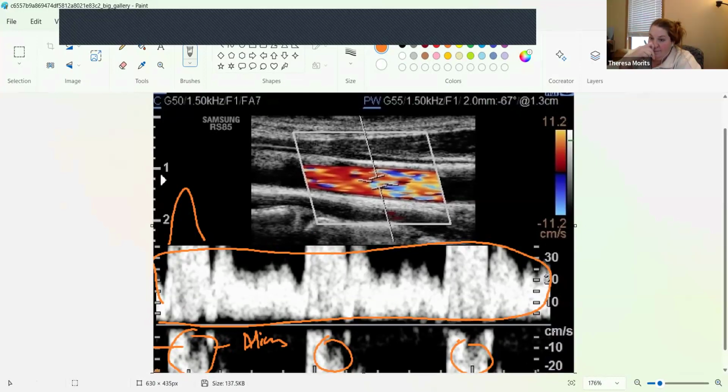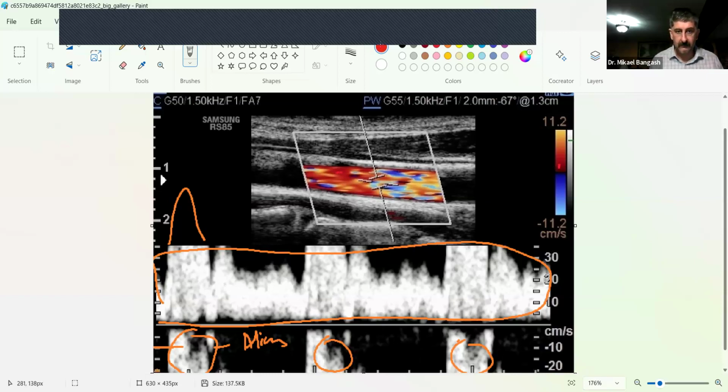Yeah. Good. Now just look at this colored blood vessel here. If you look at it, what do you see? You say, well, I see some red. I even see some of this, the yellow color within it, right? Clear? Good. But what else do you see?